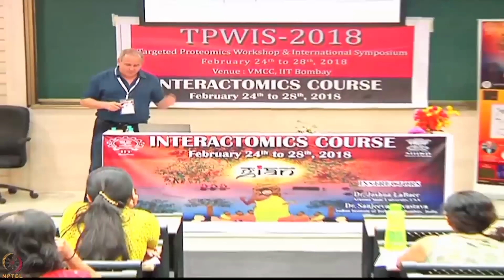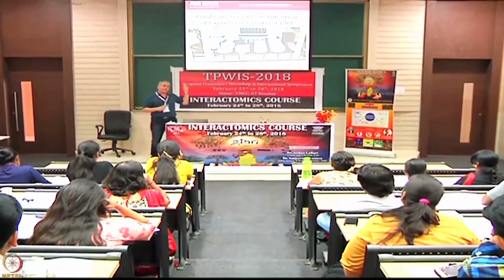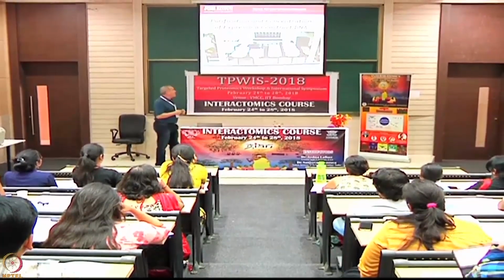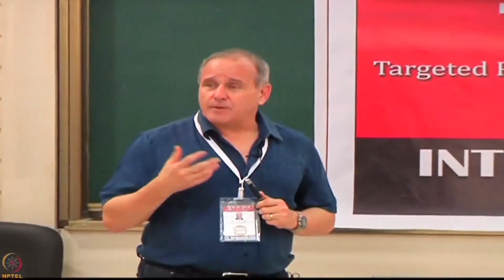So this is the method that we use to purify the DNA, or I should say the method that we used to use. Those of you who know Sanjiva, this is when he was in the lab, this is how he did it. This is an automated platform. We had worked out using a robot how to do DNA mini preps using robots. And that allowed us to do, if you were really working hard, about 600 a day in a sort of a team approach. That was not easy, but you could do it.